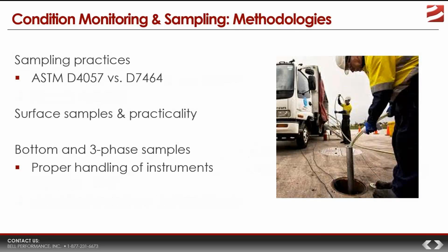So, talking about sampling, we should all be pretty much on board with this idea that good sampling helps determine whether we're going to see what we need to see or not. Without a good sample, it is impossible to know if your test results actually reflect the reality of the situation. So good samples are important.